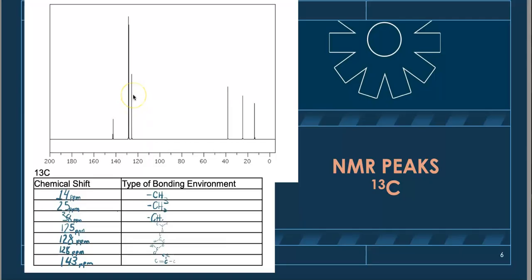There are 4 different chemical environments in the ring. 2 overlap because they are similar. Or the same, I should say. Upfield, we have 3 peaks representing the methylene-methyl group chain attached to the benzene ring.